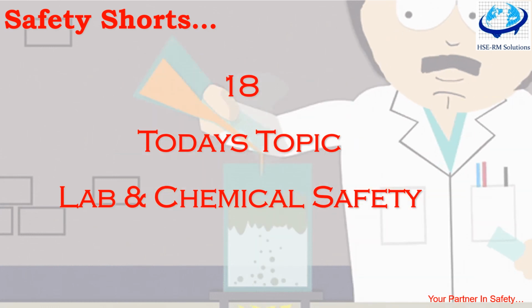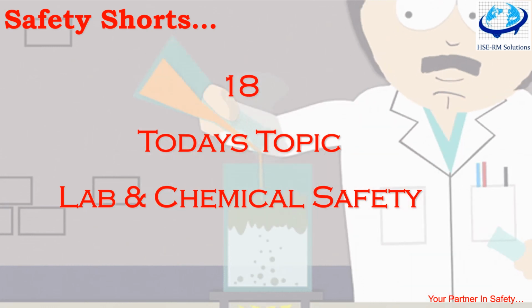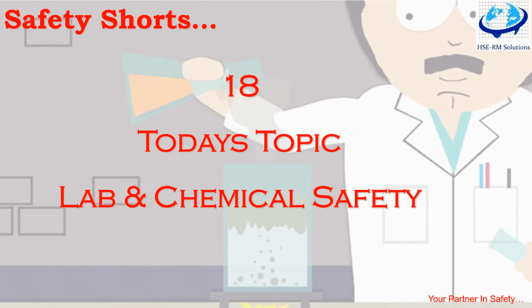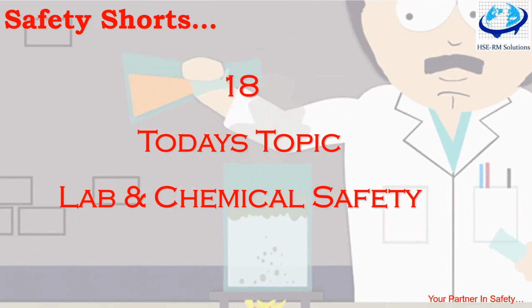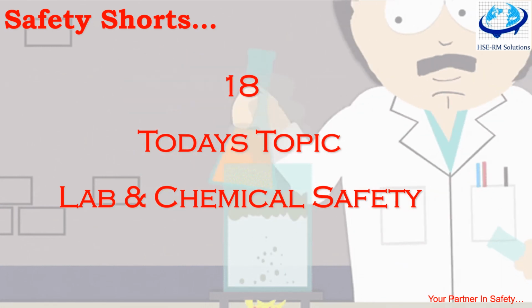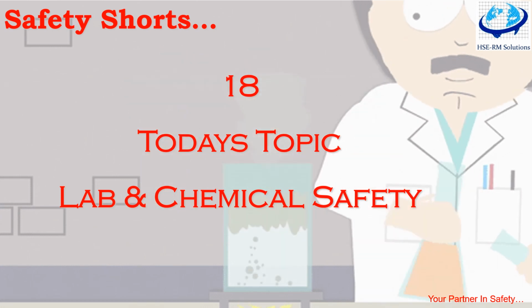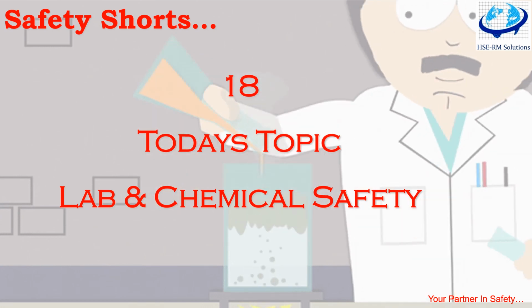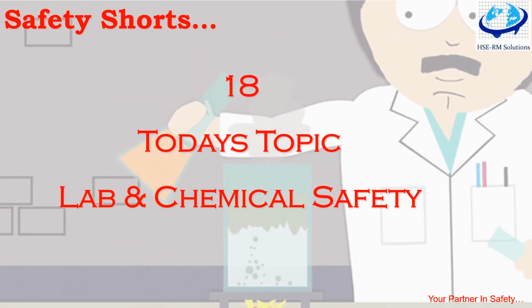Although the final product may be enormously beneficial, by and large, chemicals can be dangerous and even deadly. Corrosive chemicals are mostly used in the manufacturing of pharmaceuticals and other chemical processes, and sometimes cause serious risk to health. They can cause rashes or even death. Although they are dangerous, there are still ways to handle them safely. Knowing them reduces the risk to a great level. So let's start with knowing them.